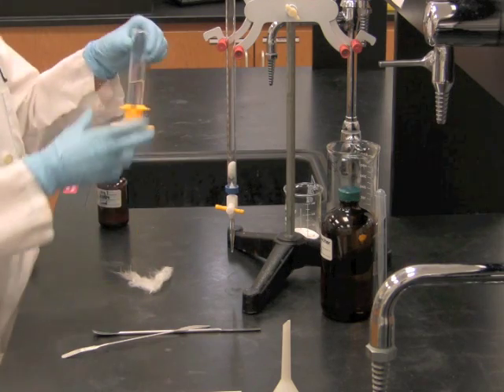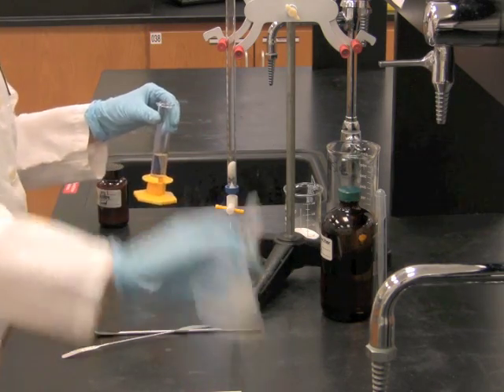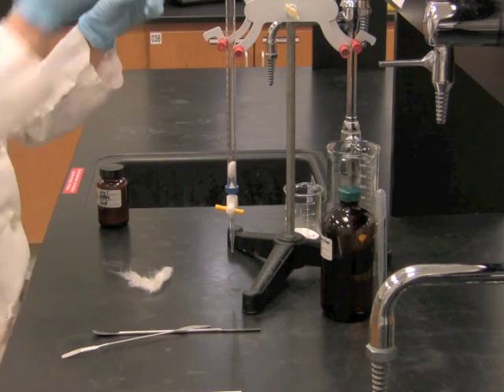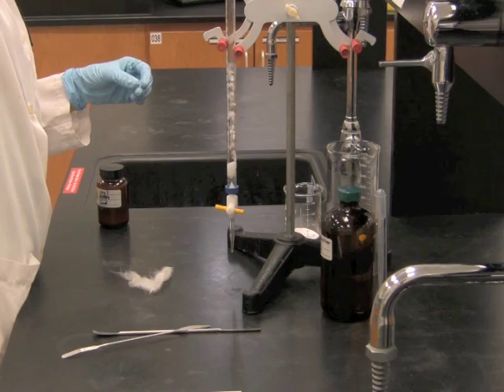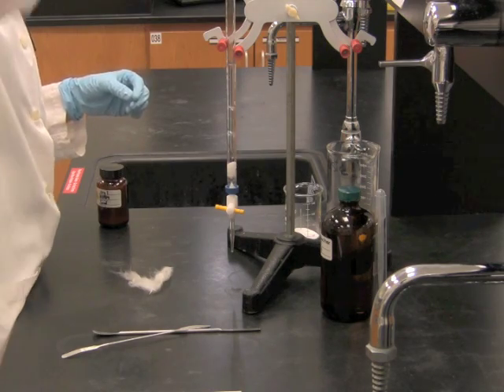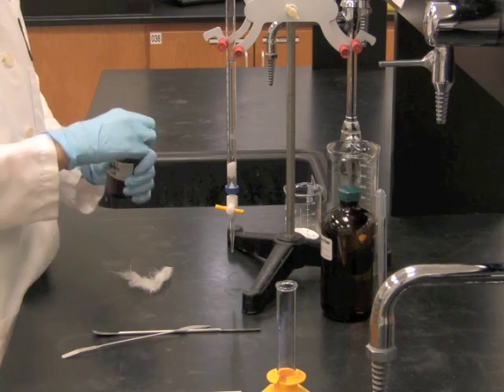Next, we're going to add 15 milliliters of low boiling petroleum ether to the column. Next, we'll add about a centimeter of sand.